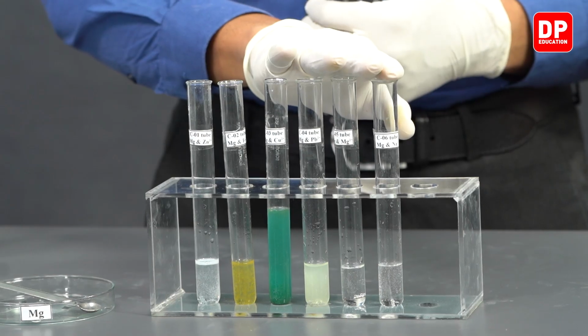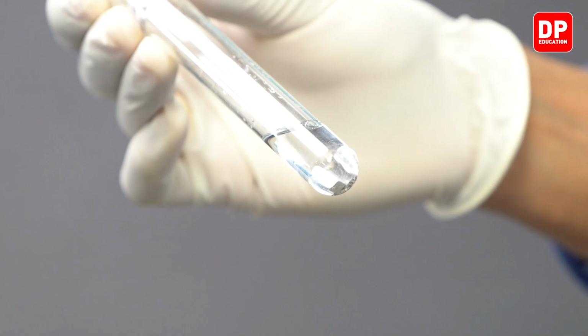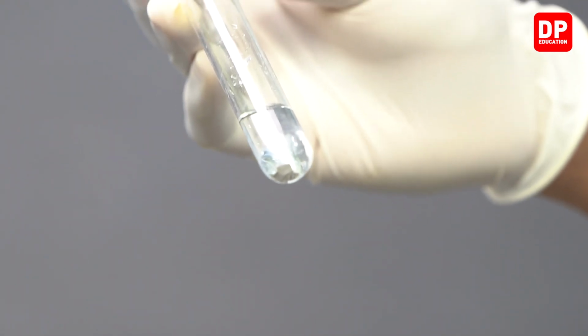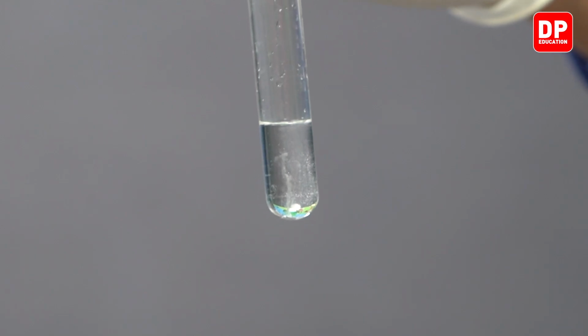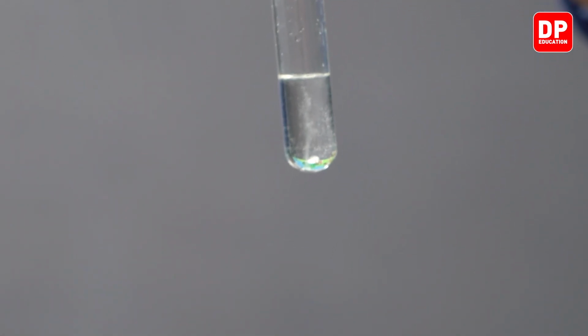What about sodium 1+ ions? Did sodium 1+ ions get displaced by magnesium? Do we see a precipitate being formed here at the bottom of this test tube? The observation would be there is no reaction when it comes to magnesium with sodium 1+ aqueous ion solution. This is because, students, magnesium is less reactive than sodium. Magnesium is not going to be able to displace sodium.